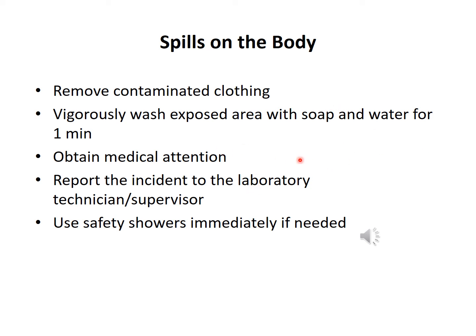So what you have to do: remove contaminated clothes quickly, and vigorously wash the areas with soap and water, for at least 1 minute of continuous running water. Not like one side and then the second side.